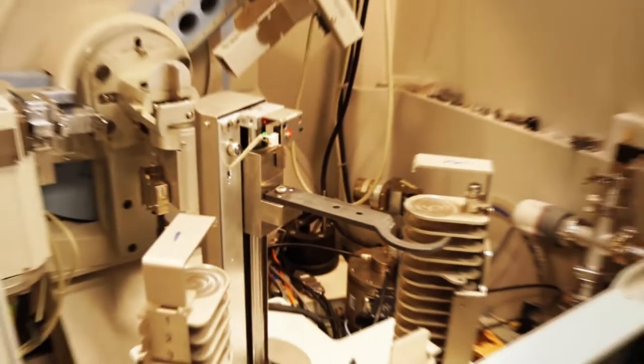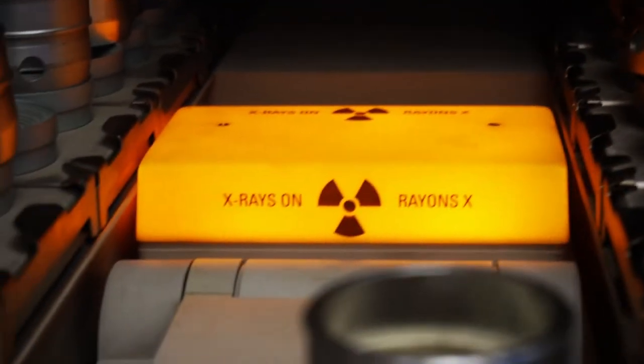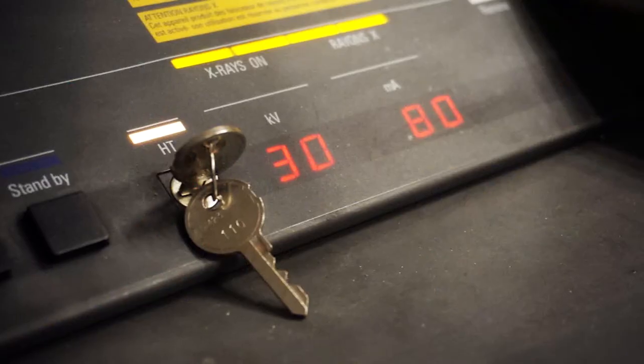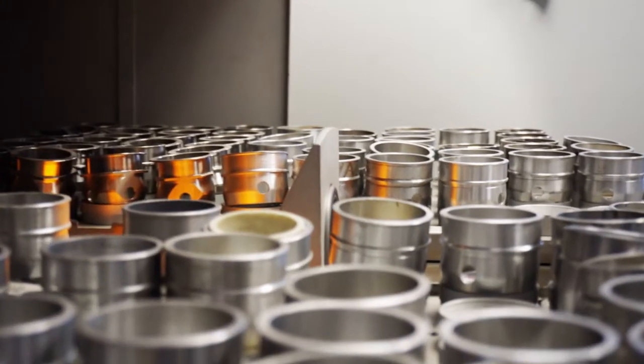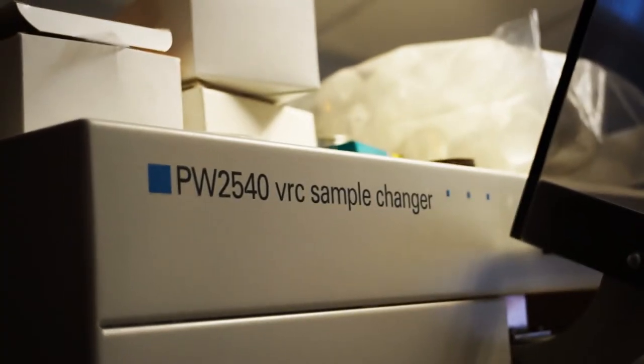A lot of what we do here is the characterisation and measurement of a whole range of materials. This machine here is an X-ray fluorescence machine that uses high intensity X-rays to bombard a sample, and by measuring those X-rays, the amount of them and the wavelength of them, we can identify what materials were in the sample.